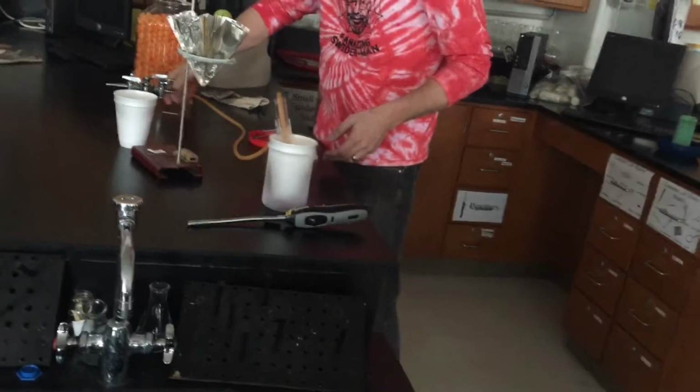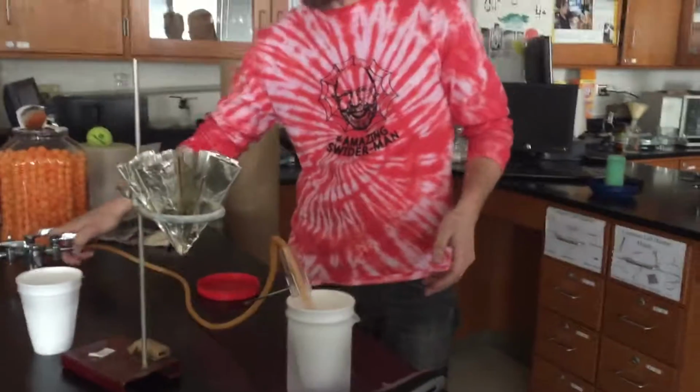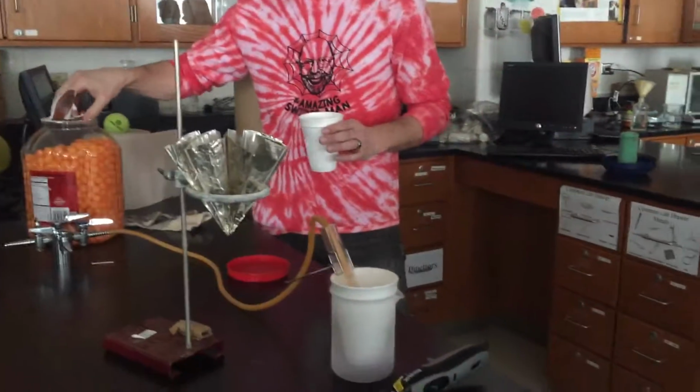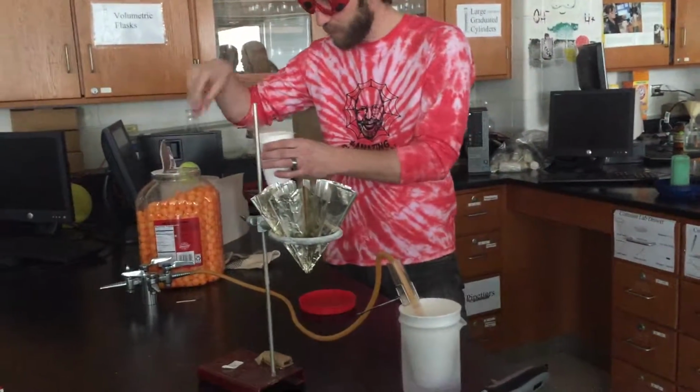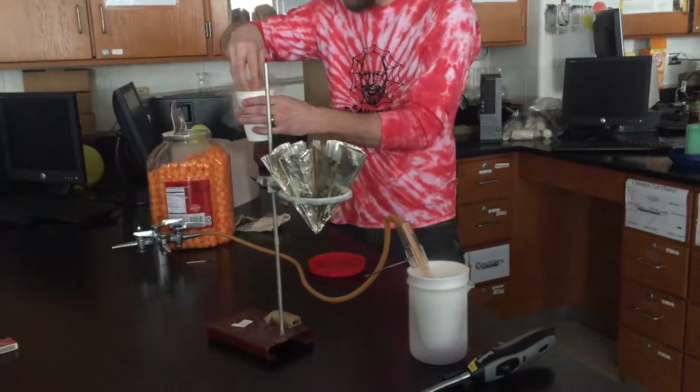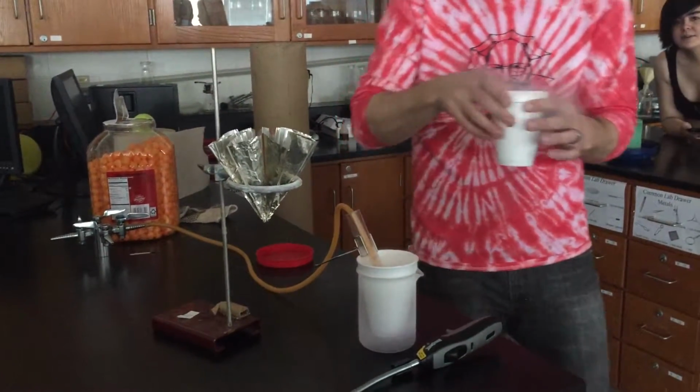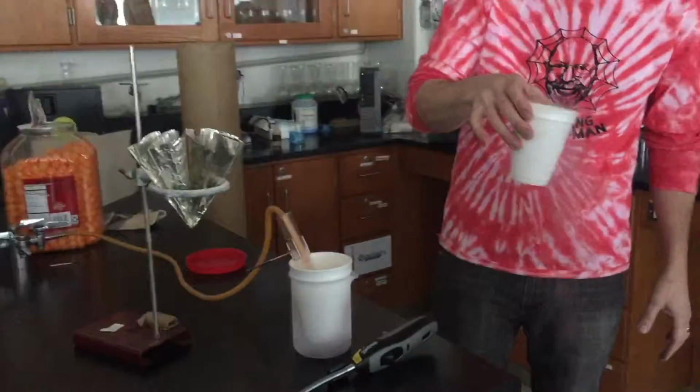As we are making that methane, can I do a lot more? I could, but I don't want to start the school on fire because I enjoy being gainfully employed. I'm going to take some of these cheese balls, a new batch, freshly opened, and I'm going to cool them down with nitrogen.